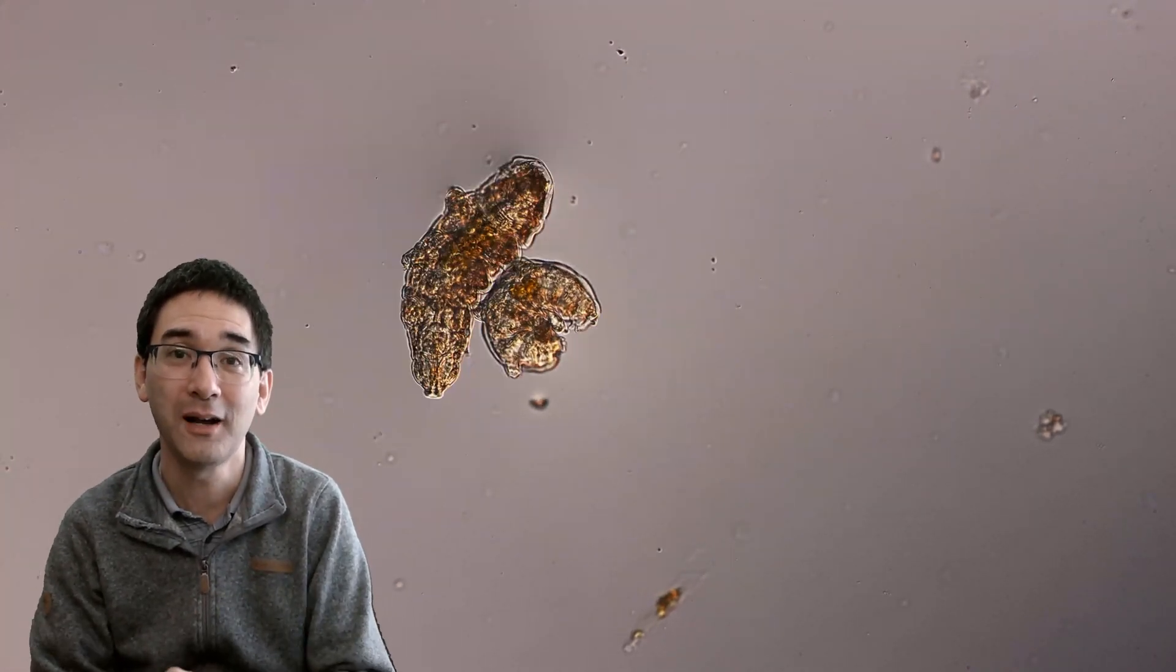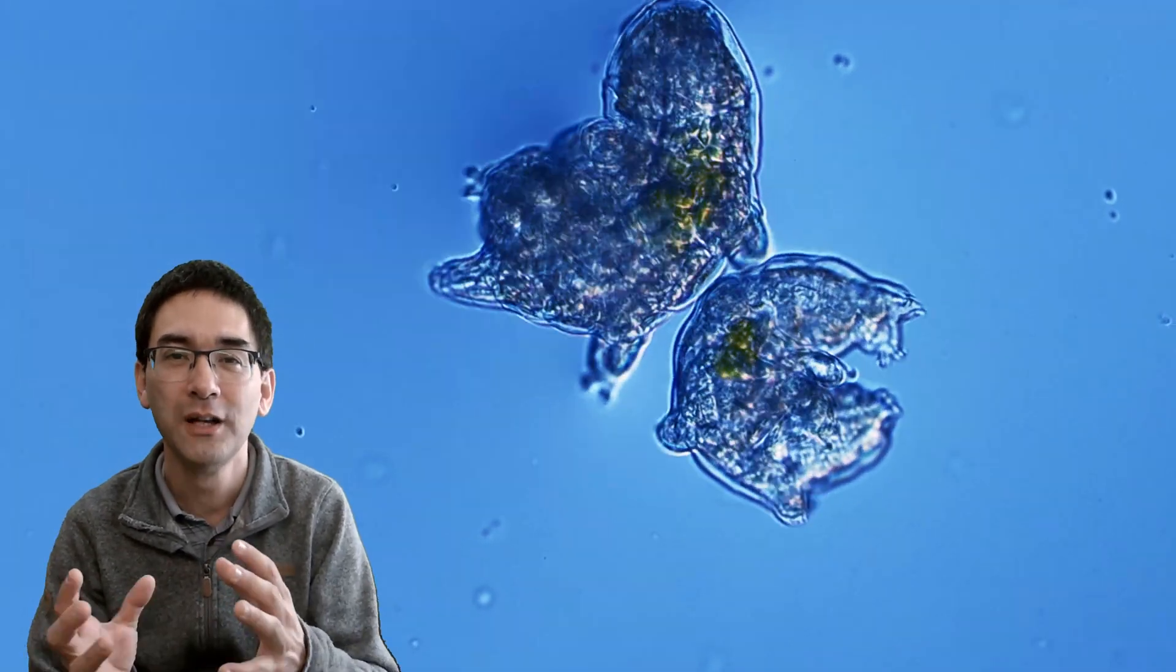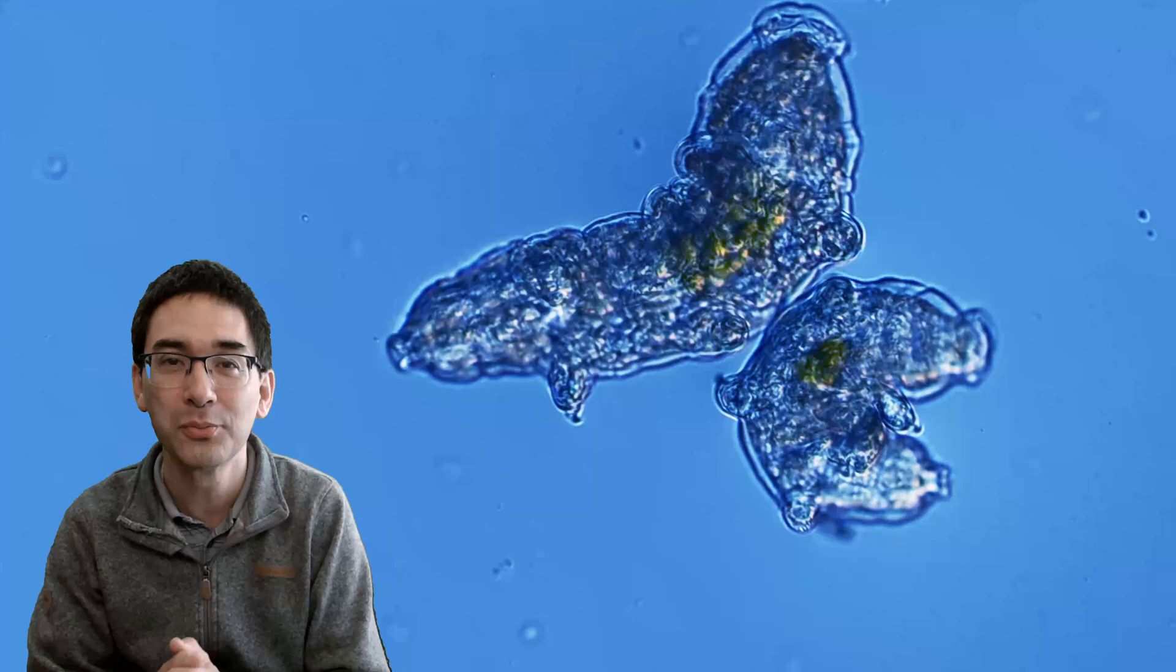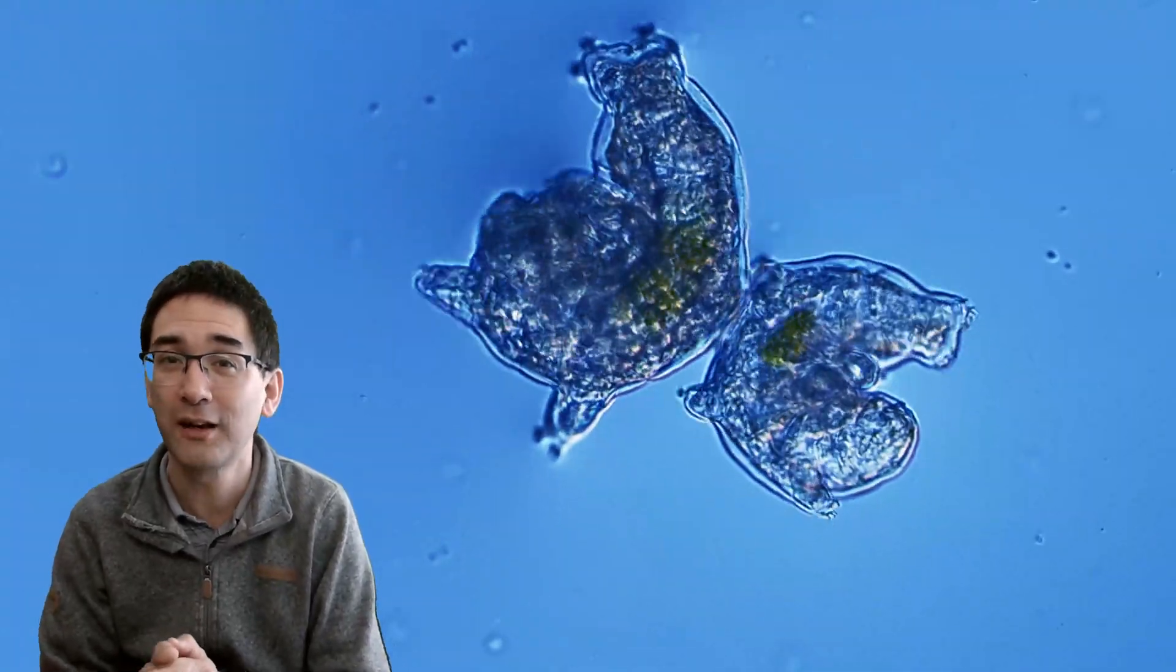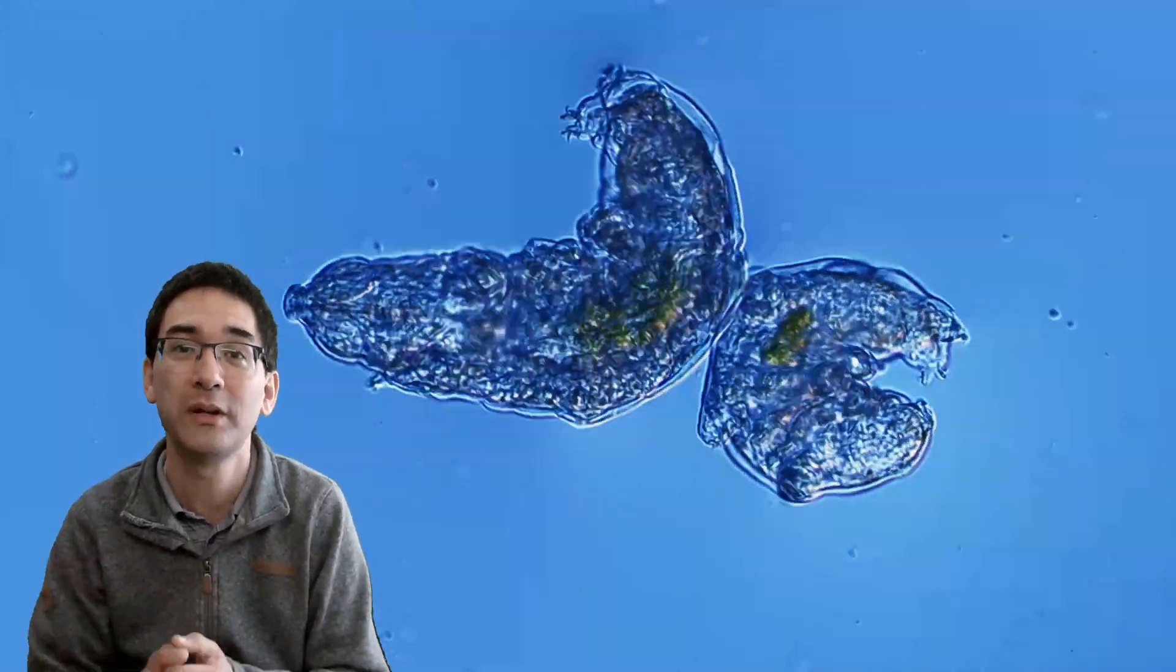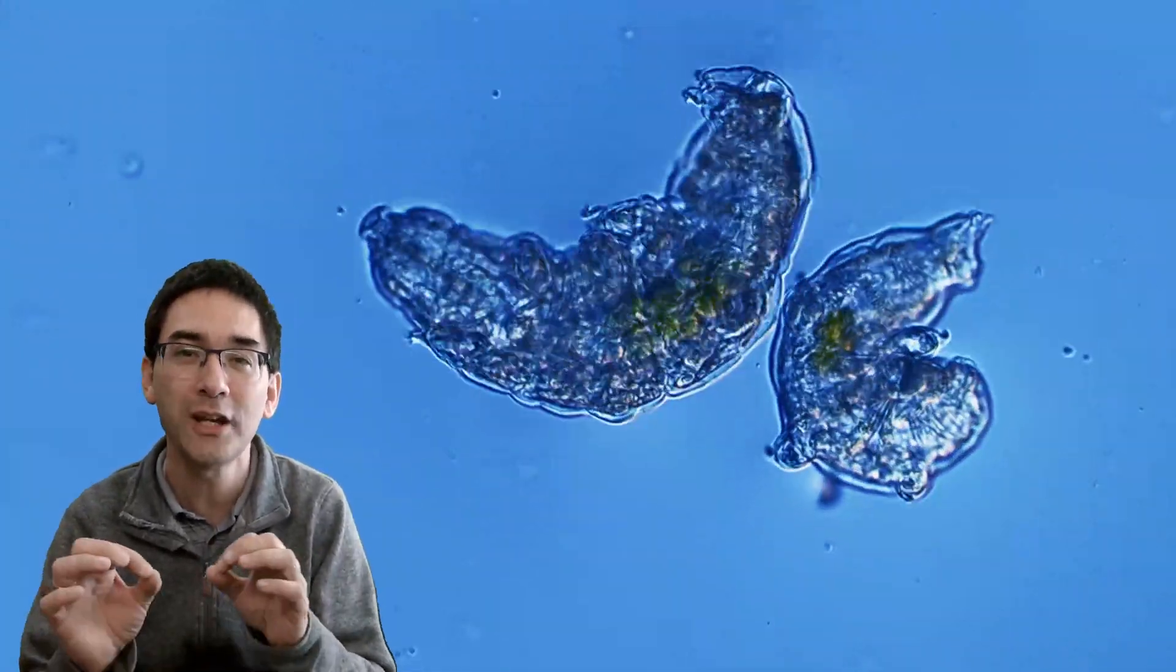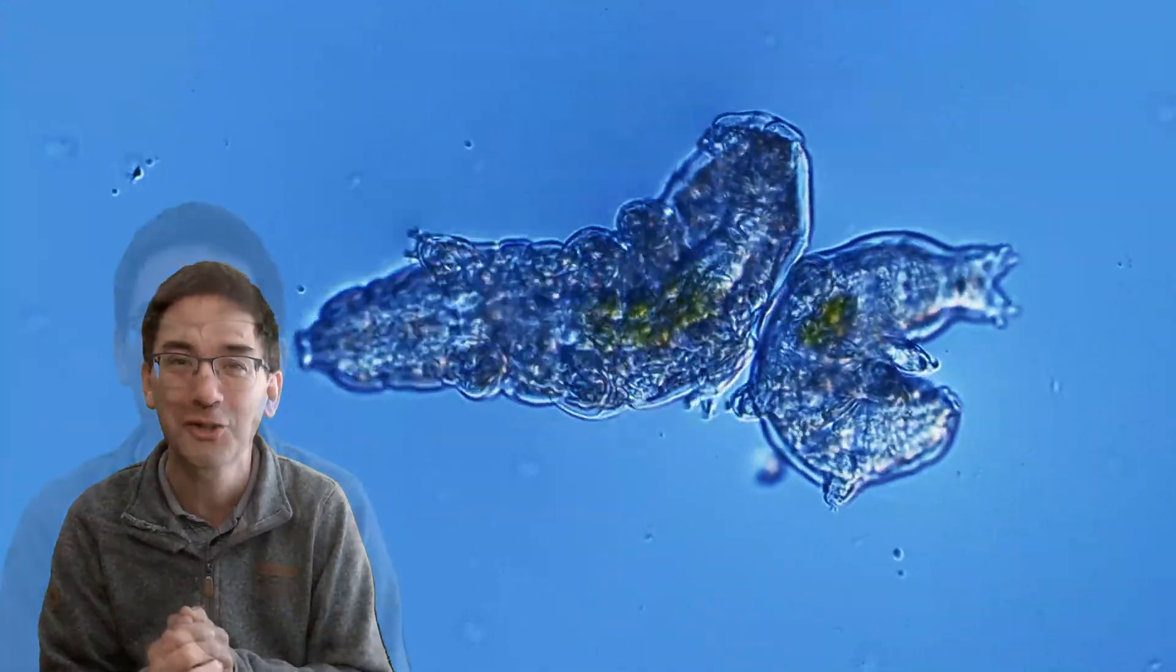And people keep on asking me, well, how do you actually do it? How do you change the colors around so nicely? And how do you make sure that the quality is so good? For example, this one over here is blue. Well, I'm not always using filters, I have to tell you. A lot of the things I'm doing in post-processing. So in the video editing program, I'm able to change the colors around a little bit. And this also makes it a little bit more interesting for you as the viewer to watch.